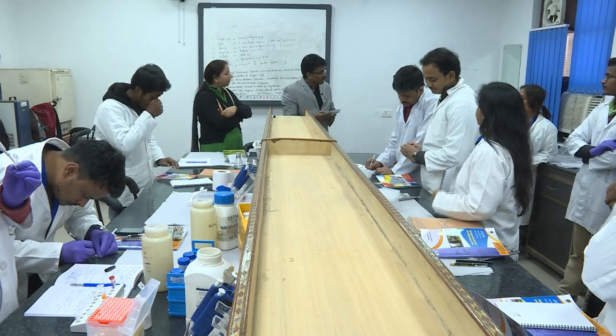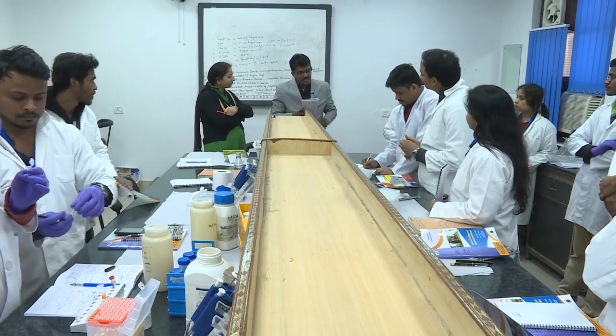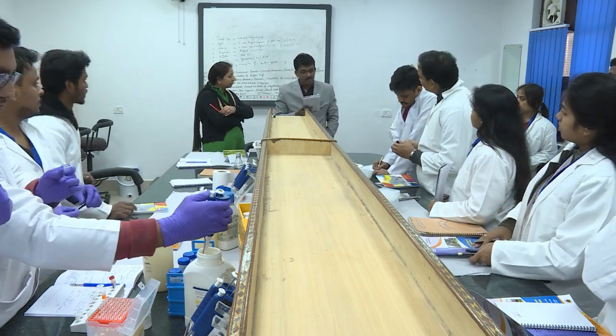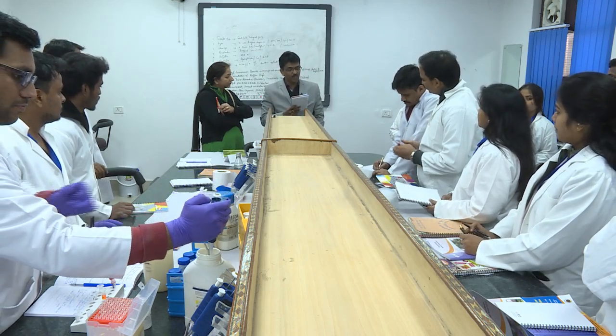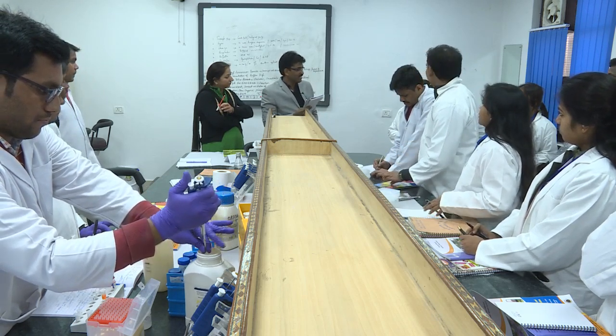Group number 5. So, now they are leading the race. They have an A260/280 ratio, a very impressive 1.8, 84 is there. Okay, let us take it as 1.84. That's pretty good in terms of DNA quality.